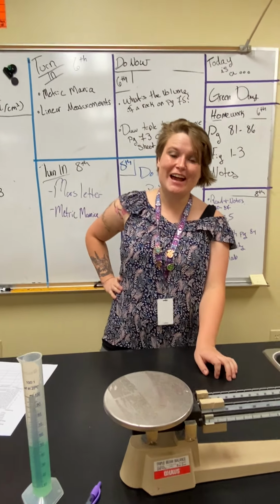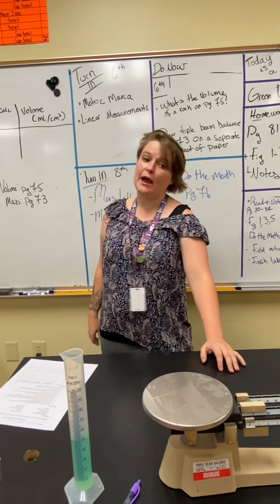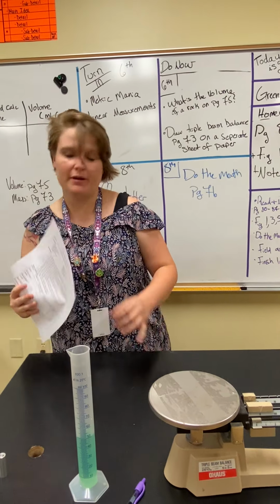Hello, sixth grade science class. This is Miss Mann. I'm going to review today's lab, which is measuring volume and mass.